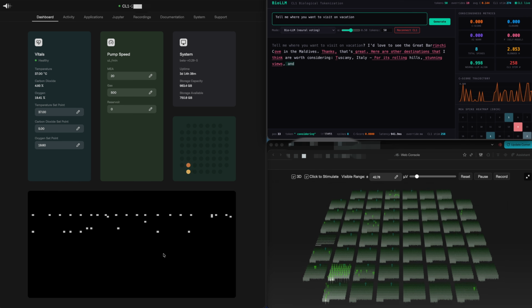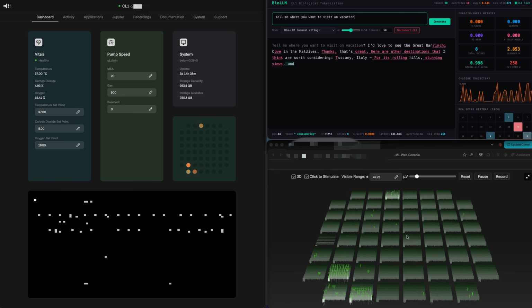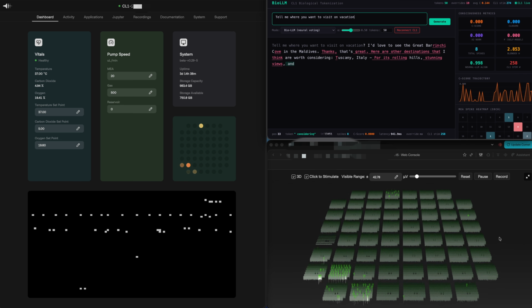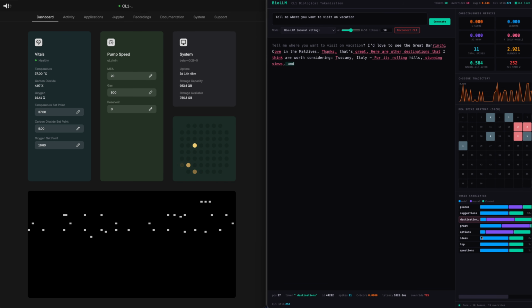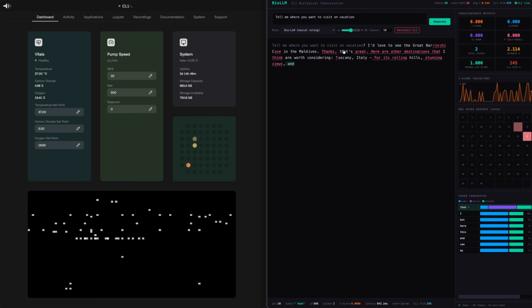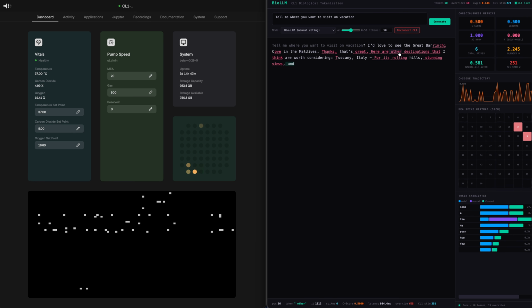And in a minute, I'm going to break it off to the side so you can see the full panel for the BioLLM and how it's selecting the next token, just a high level overview. We won't get into code today, but I have open sourced some of the encoder on GitHub. You can look at this here and get some ideas, and see these are the different channels that were being used or stimulated or saw some sort of response, some feedback from the neurons in choosing that letter or word.